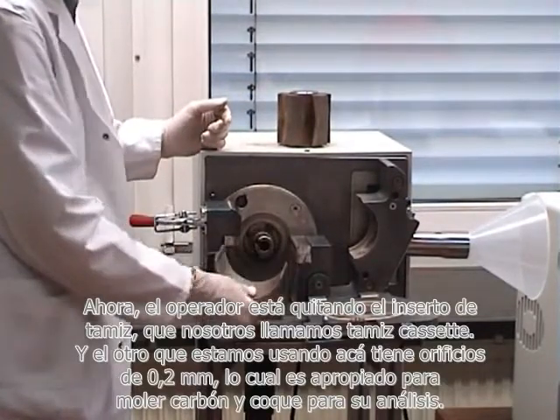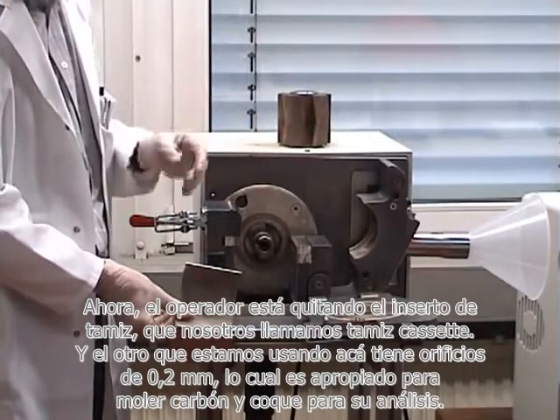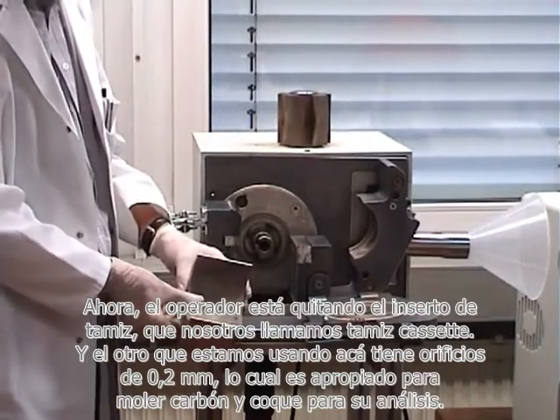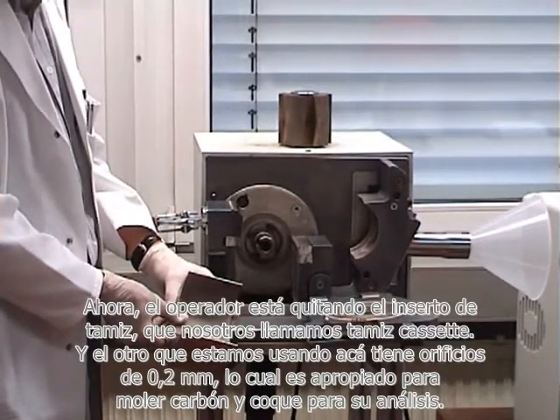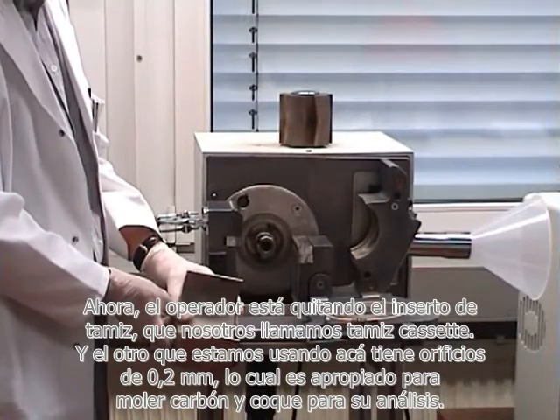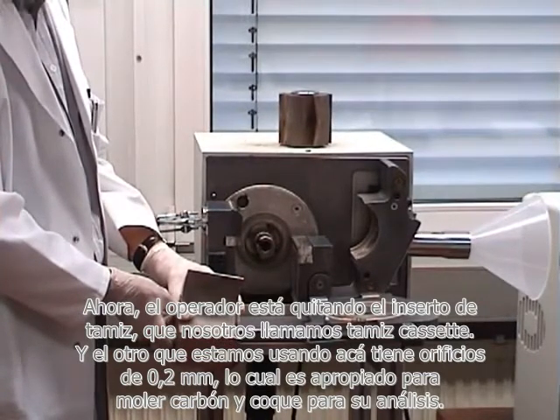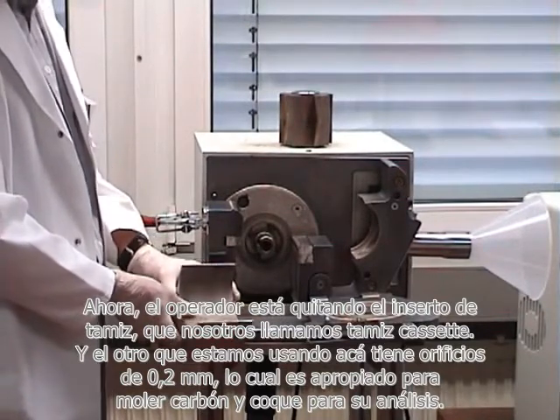Now the operator is taking out the sieve insert — we call it a cassette sieve. The one which we are using here has hole openings of 0.2 mm, which is appropriate for the milling of coal and coke for analysis.